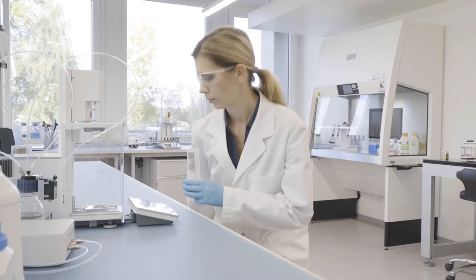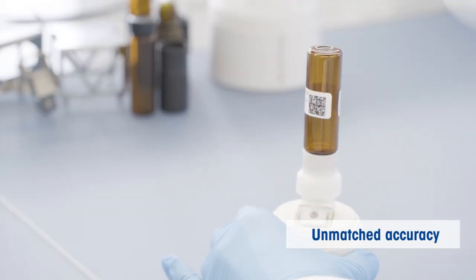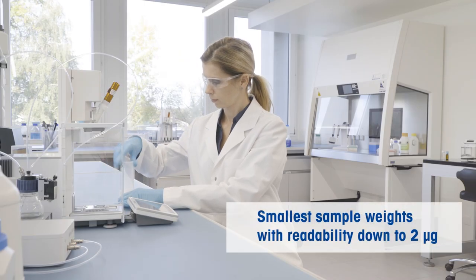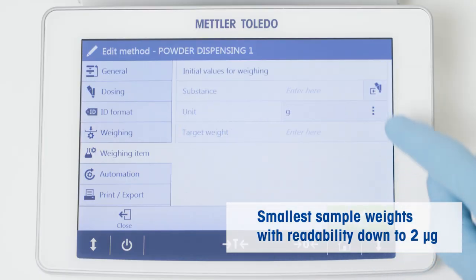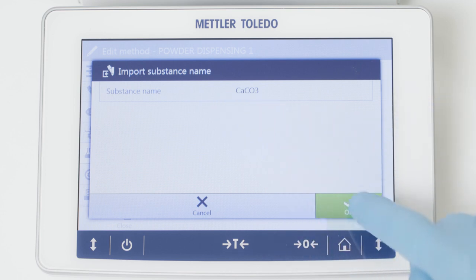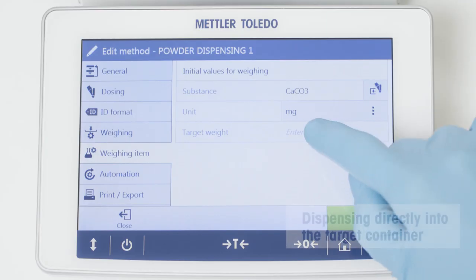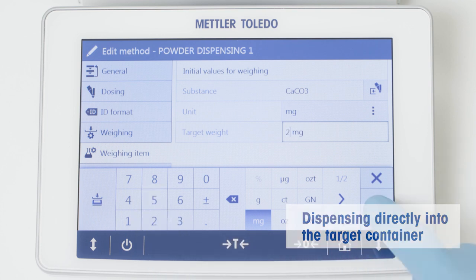The XPR Automatic Balance enables you to achieve a level of unmatched weighing accuracy and reproducibility in the simplest way. Extremely small samples, even 1 mg, can be dispensed with up to 2 mcg readability. Simply enter the desired amount on your balance terminal and the precise amount is dispensed directly into your container in a fully automated process.